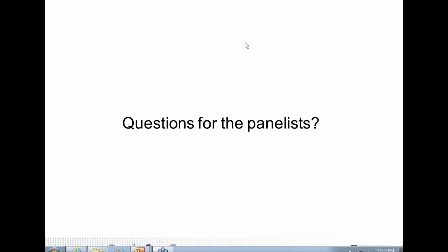Okay, fantastic. So here's an interesting question. Has the interest in subset analysis for chimerism been driven by your clinicians, or is there an educational effort needed on the part of your labs? So essentially, has a strong clinical relevance for subsets been established, or is this in process? I'll direct that one to Kurt. Yeah, I would say it's been driven by our clinicians at this point. We let them know when we first had that capability, and they were very much interested, particularly with T cells, depending on the protocols and regimens they're using on these patients. The percentage of samples that we're doing lineage-specific analysis on has increased since we began. But I would say it's driven by the clinicians.